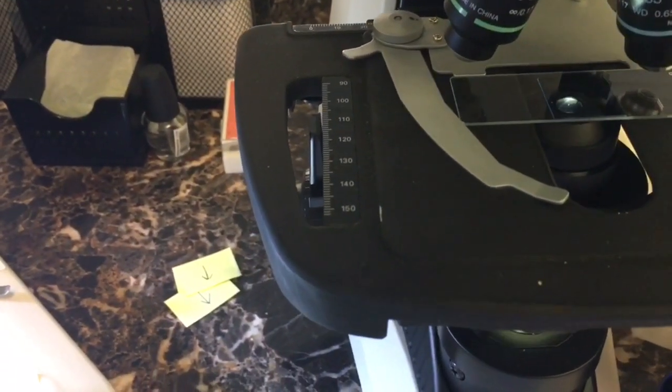The dye, if you're curious, is lactophenol cotton blue, which tends to stain chitin dark blue, which brings out the edges of hyaline structures.